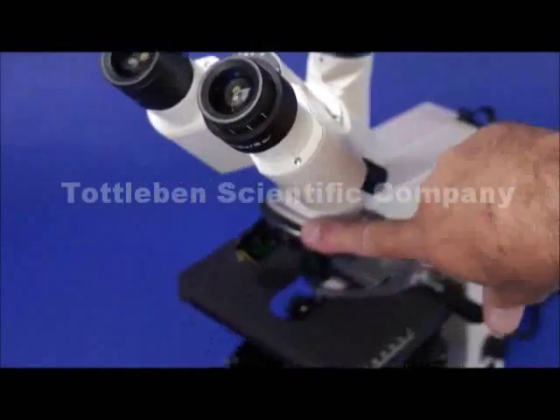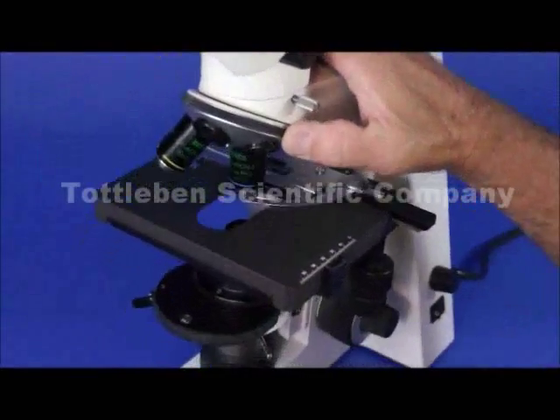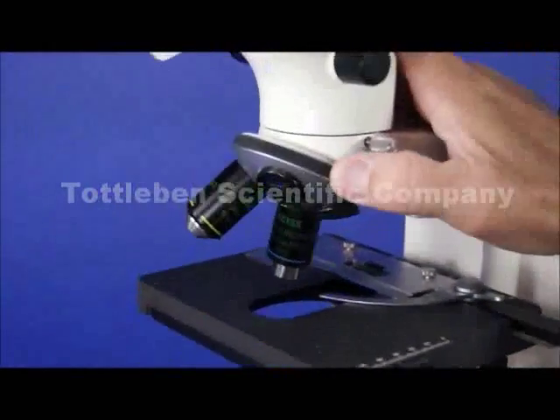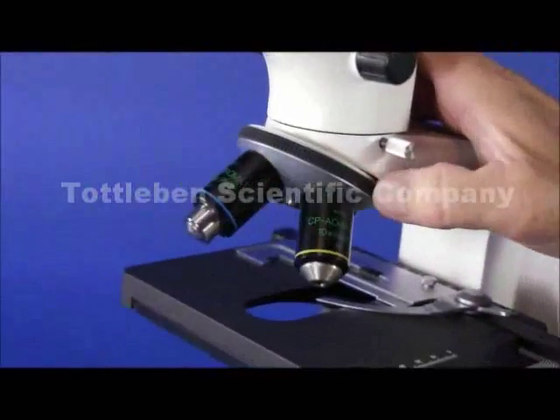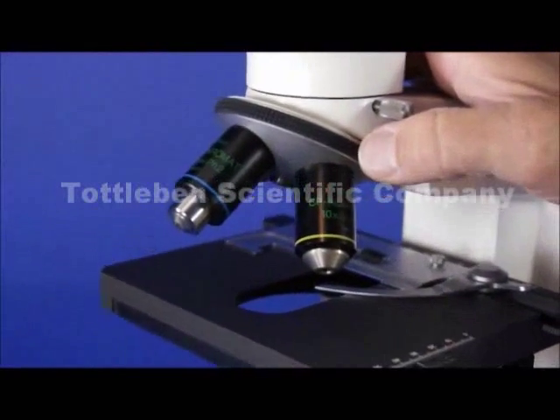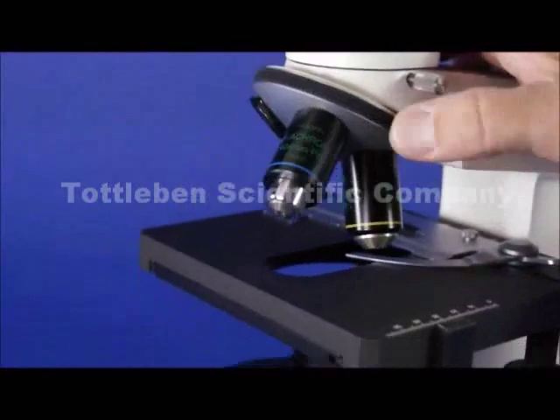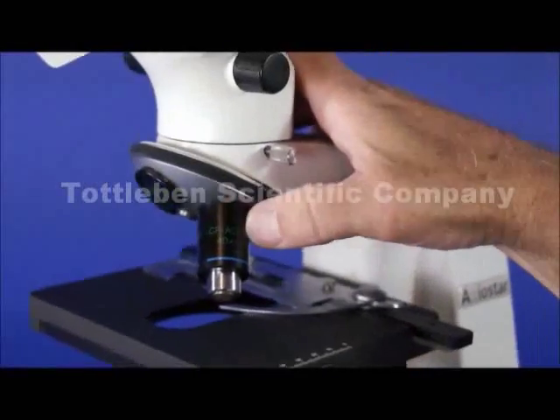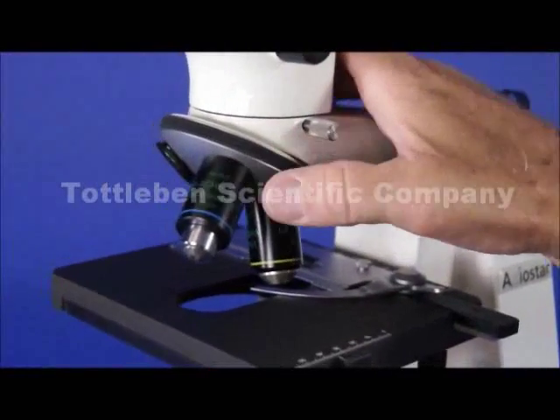Moving down the microscope to the nose piece. It's a four place nose piece. There are two phase contrast objectives on it. A 10X CP Acromat which is phase one and a 40X CP Acromat which is a phase two.